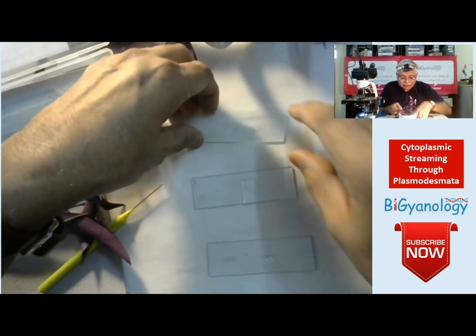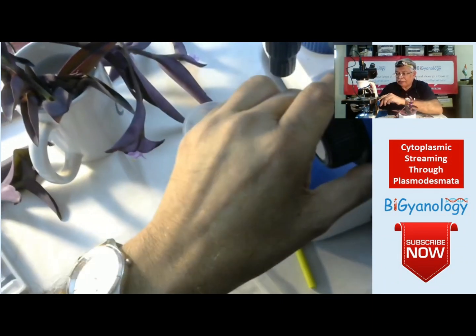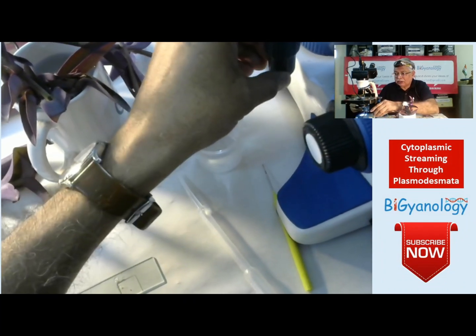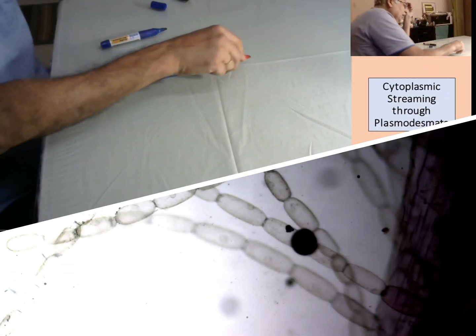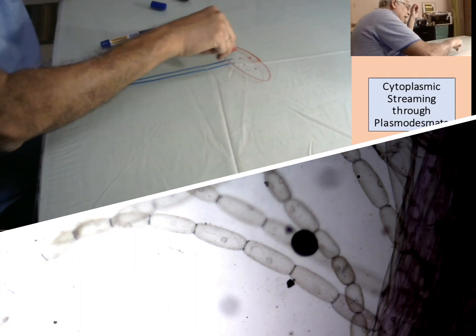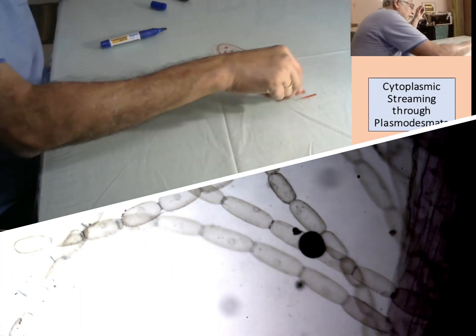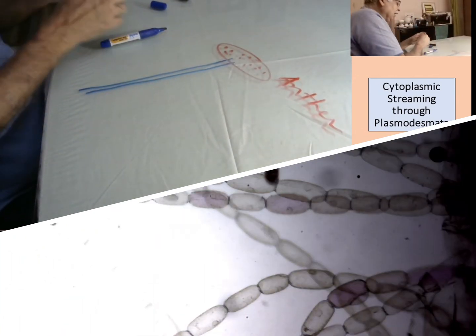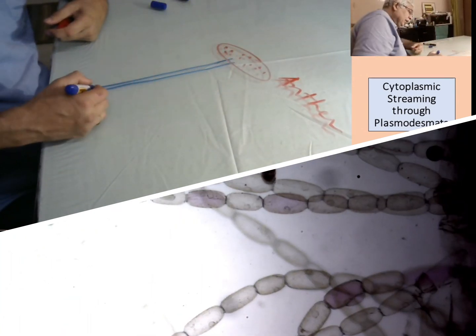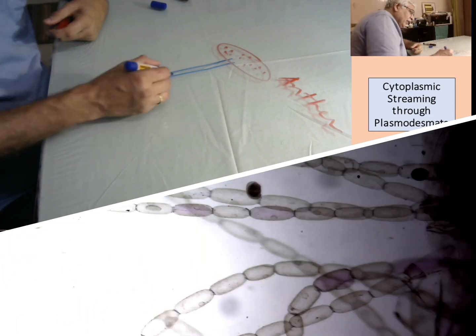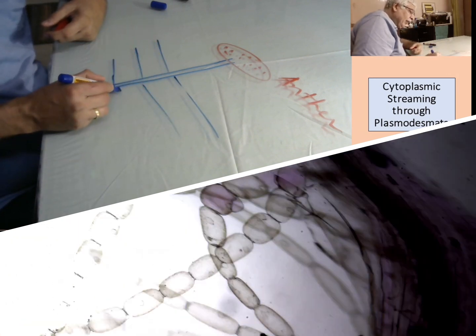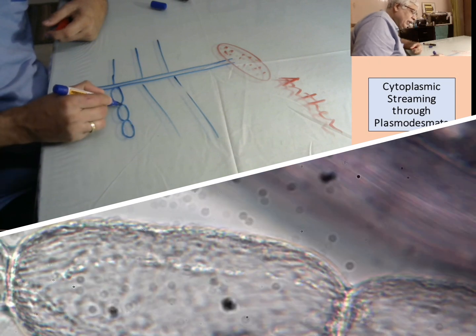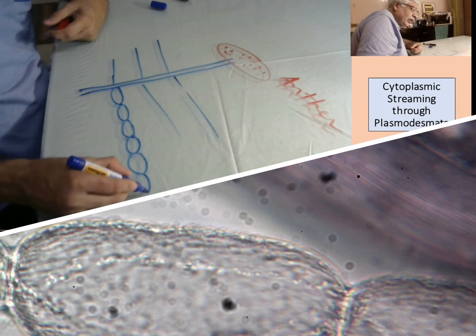So now how will it look like when I put it in the microscope? We now have a trinocular microscope with a digital iris in the third port. Take the stamen which has the anther and pollen — this is the anther, and the filament has long hair. We can see the long hair by our naked eye, but the moment we see through the microscope we see that the cells are roundish and joined in a line.